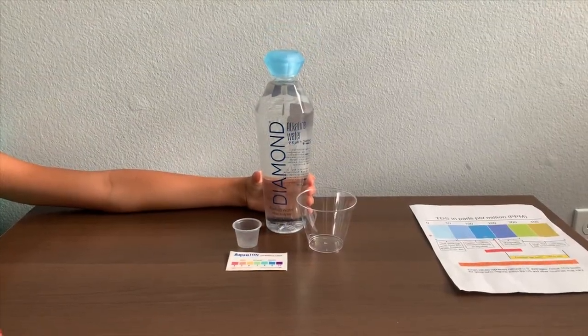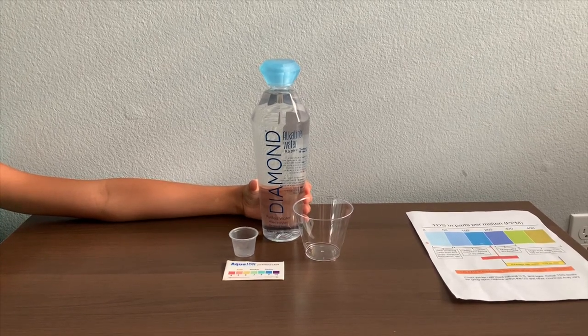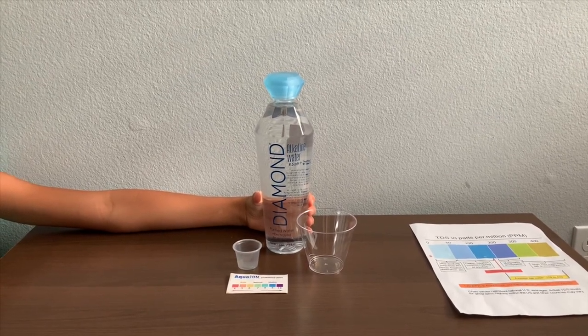This is Diamond purified drinking water. We bought it from Ross and it cost $2.69. It says its pH is supposed to be 9.5 or higher. Let's test and see the pH and TDS results.